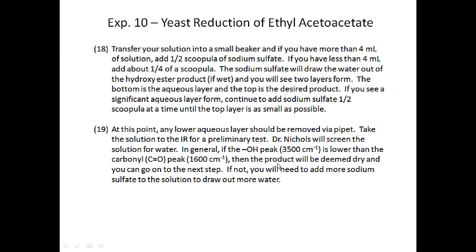Now, if you have less than 4 mils, you might add just a quarter of a scoopula, and what I mean is about half as much as you would get if you just stuck the end of the scoopula in and added. But if you add sodium sulfate to this solution at this point, the sodium sulfate begins to actually draw the water out of the hydroxy ester product. And if your product is really, really wet, you'll actually see 2 layers start to form in the beaker.